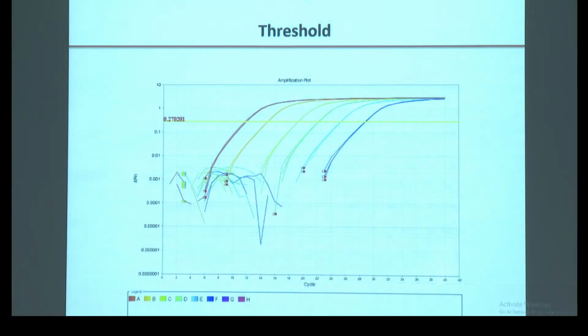So when we are performing qPCR, you will see a terminology called threshold. It is a horizontal line which is drawn on the y-axis of this fluorescence, and it can be moved up and down in the machine. Not here, it is just a picture. We have to keep it in the log phase only, because there the data are predictable. If you place it up here, you will not get a proper prediction, and if you bring it down here in the junk region, you will not get it properly either. So this horizontal line drawn on the y-axis tells us where to take the data.